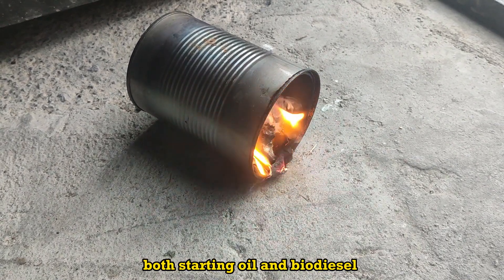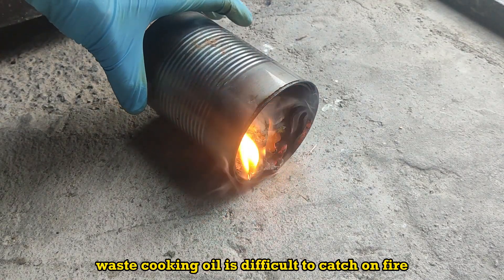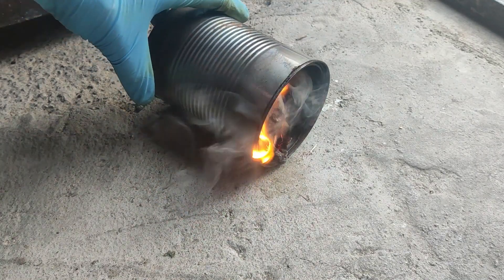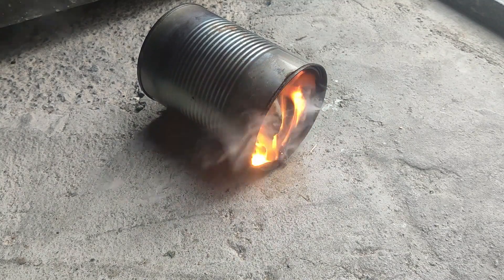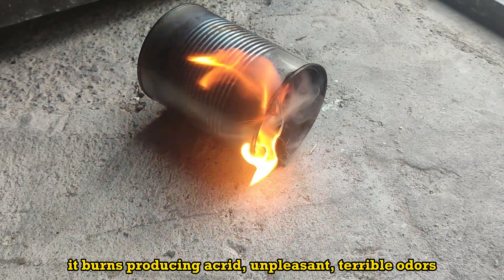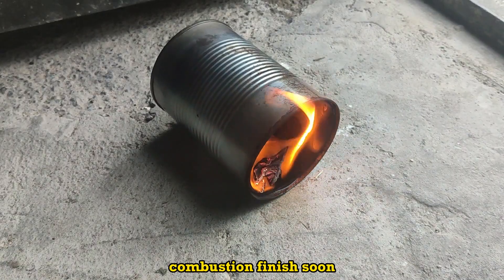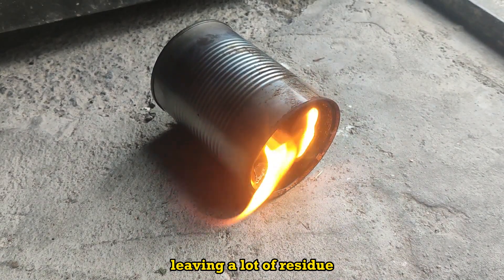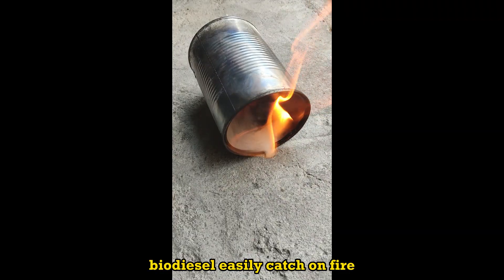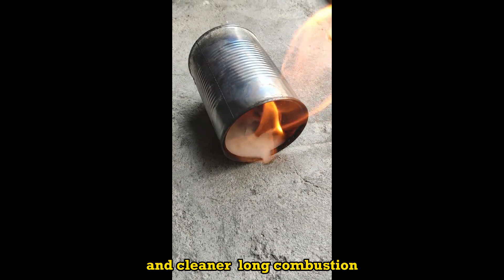Both starting oil and biodiesel are burned with a paper towel. Waste cooking oil is difficult to catch on fire. It burns producing acrid, unpleasant, terrible odors, and combustion finishes soon leaving a lot of residue. Biodiesel easily catches on fire, with a stable flame and cleaner, longer combustion.